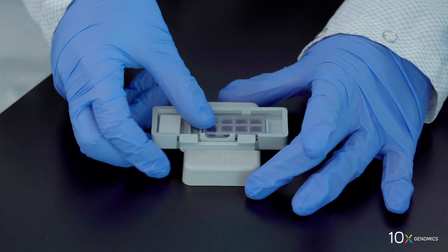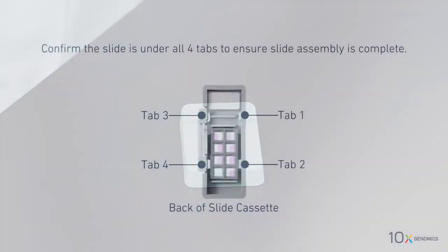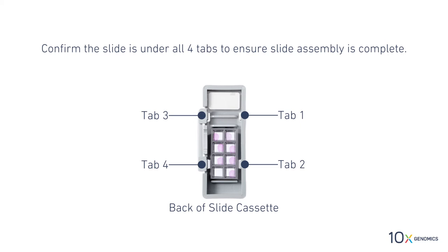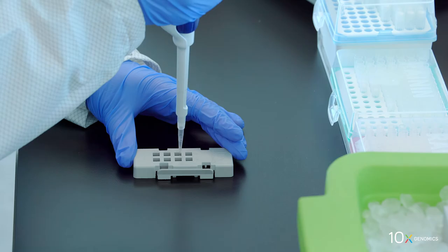Remove the slide cassette from the alignment tool while pressing the slide against the gasket. We have assembled the slide cassette. Next we will permeabilize the tissue.